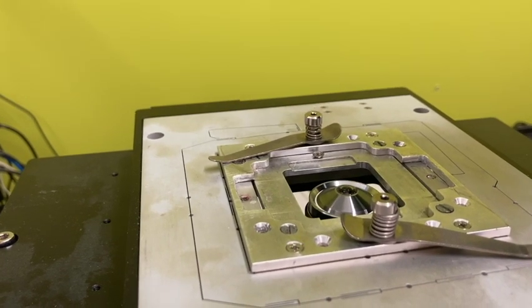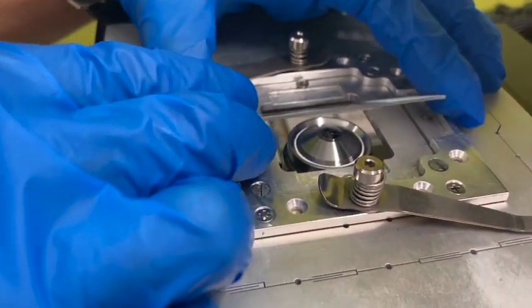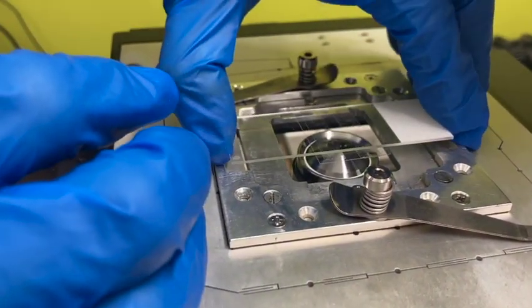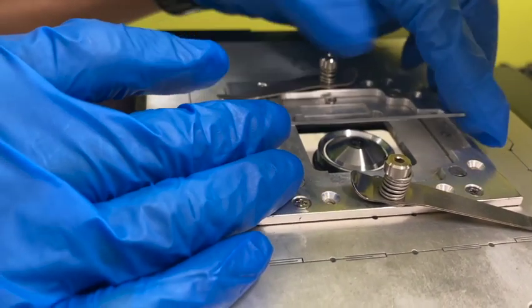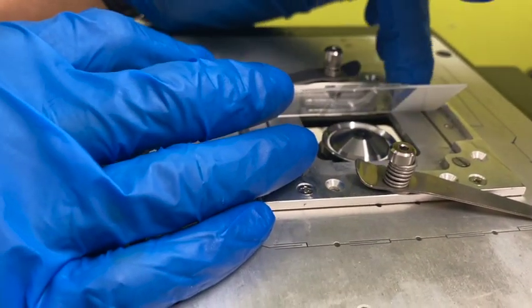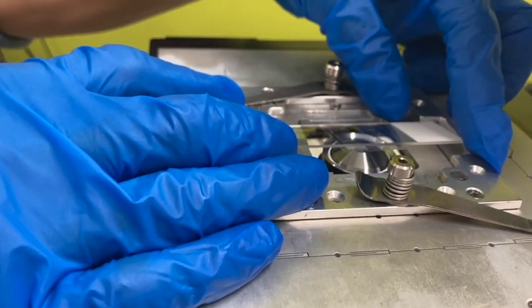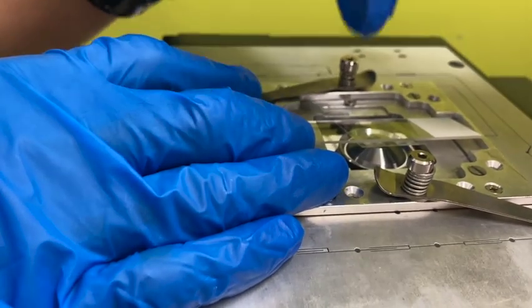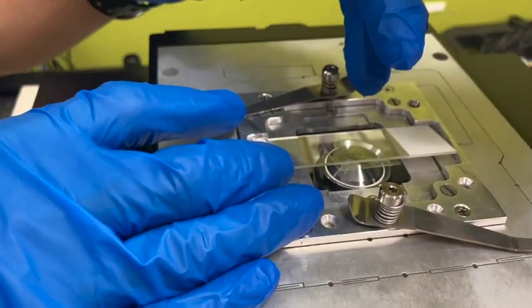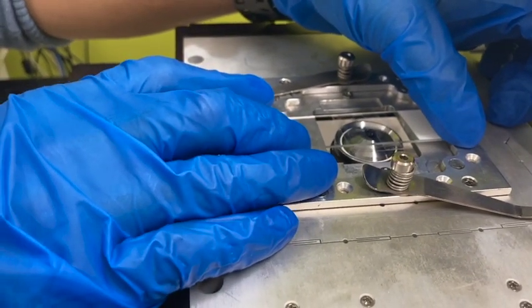Why not? And then when you put on your sample, you can do it directly this way, but it's better to do it this way, which means I'm going to contact this holder and then do it from one direction. In this way, you can push out whatever bubbles, so there's not going to be any bubble between the sample and the objective.